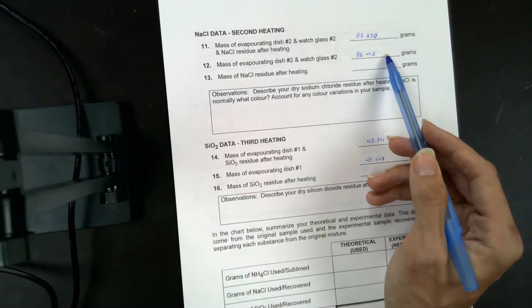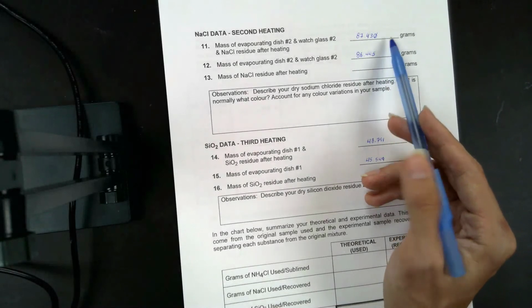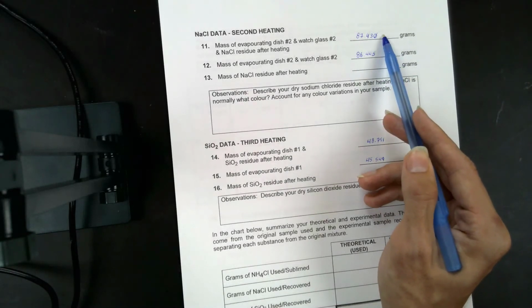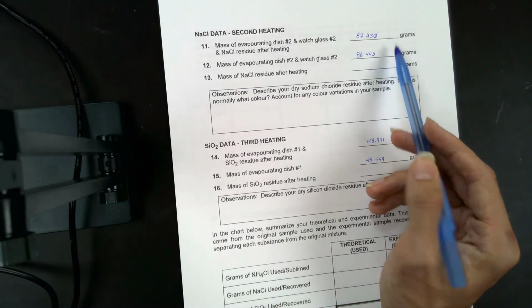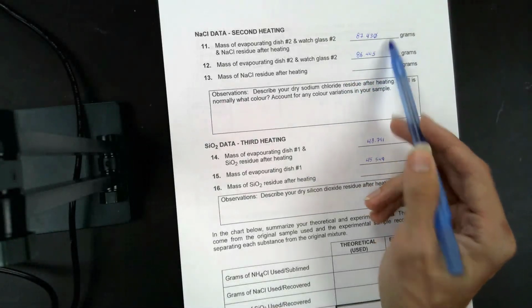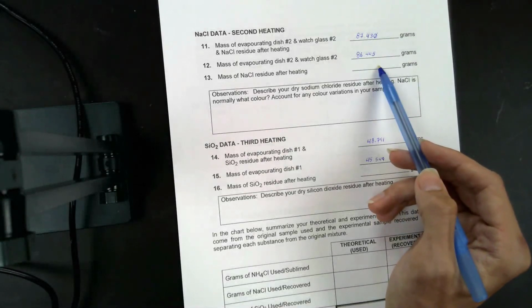Below it, item 12, this is just the mass of the dish and the watch glass. So here I've got the dish, the watch glass, and the salt crystals. Here I've just got the dish and the watch glass. So ideally, again, kind of like the last part, the difference of these two will give me the mass of just the salt crystals.